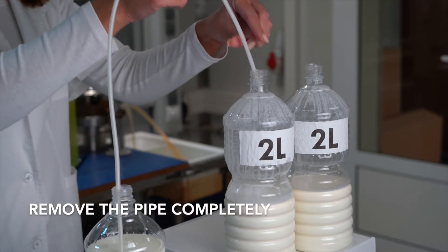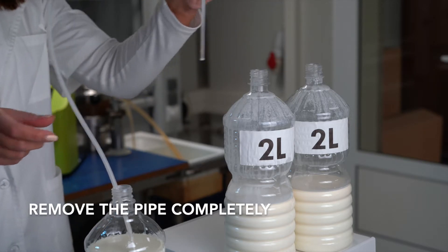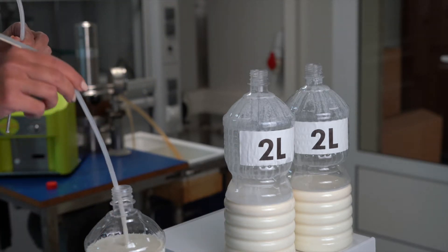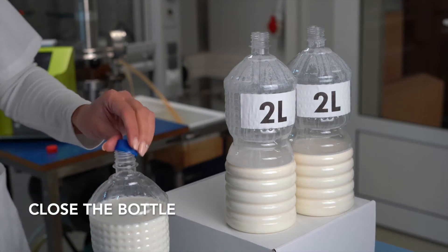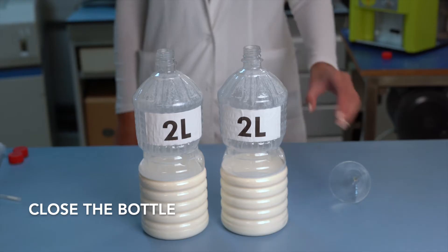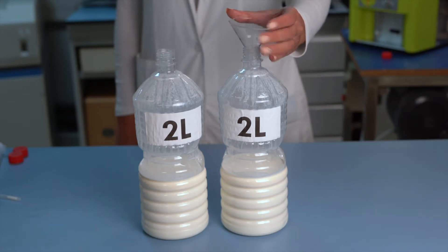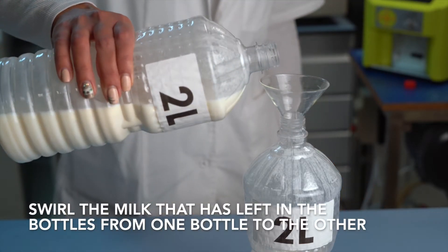Remove the pipe completely and close the bottle. Swirl the milk that has been left in the bottles, transferring from one bottle to the other.